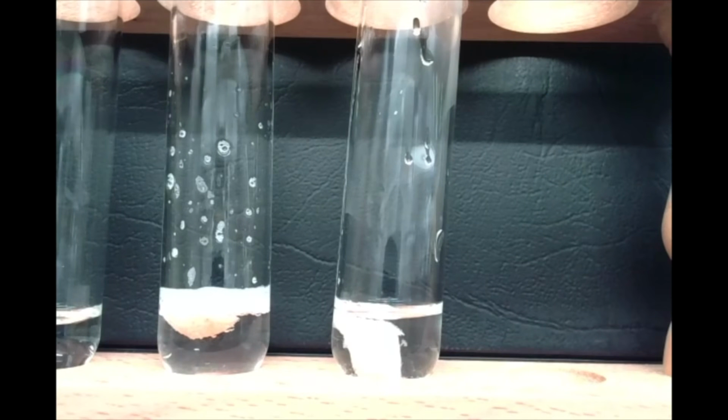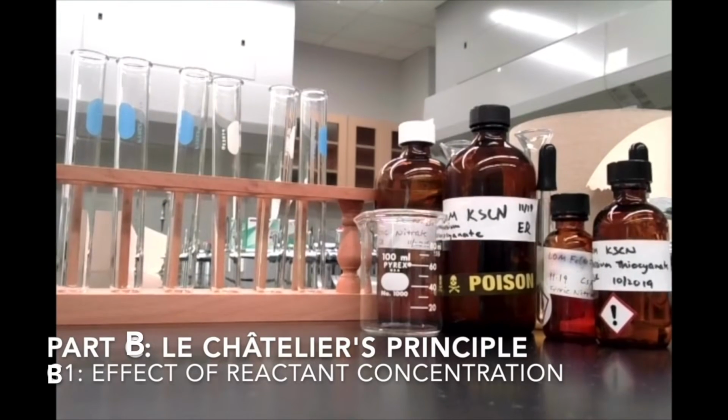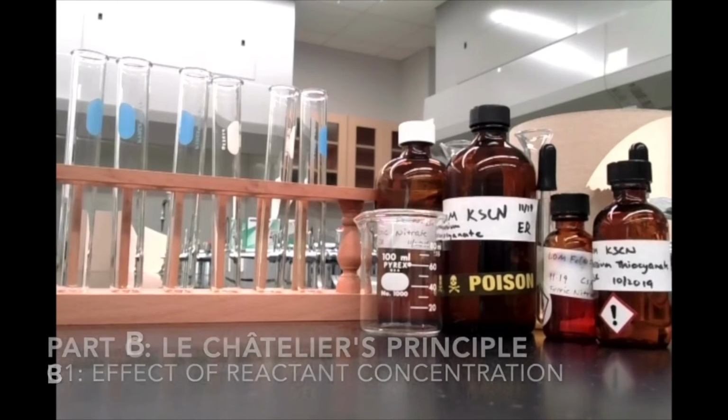Its physical and chemical properties change when you heat it up, and it changes its shape. So the catalase that's present in a boiled potato no longer functions as catalase. So that's something to keep in mind. In this last part of the lab, we're going to look at one equilibrium in particular.